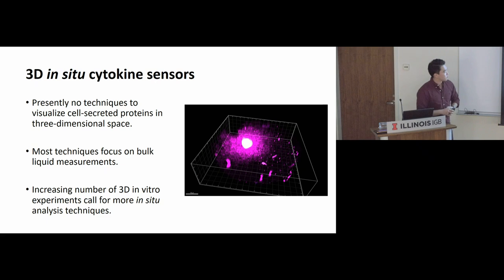As I said, most techniques focus on bulk liquid measurements. And since there's now an increasing number of 3D in vitro experiments, a system where you can capture this cytokine and analyze it would become more and more useful.